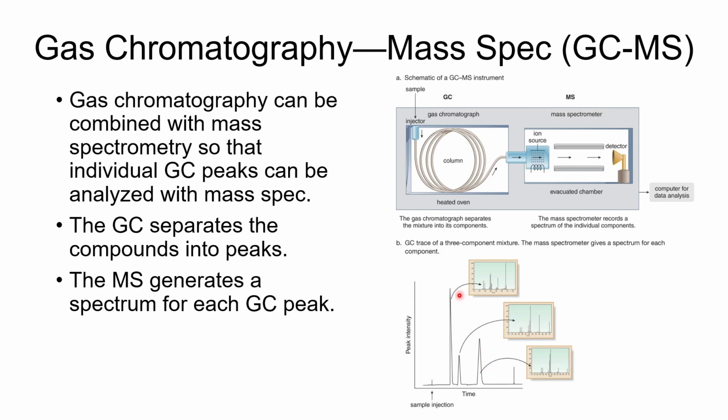You can even take this and do high-res mass spectrometry with it if you're very clever, although that costs a lot more to do. But this is just an example of what you can do. So if you've got a sample of compounds, you can kind of determine what they are and then combine that with some of our other spectroscopic techniques that we're going to talk about in future chapters. You can get a pretty good idea of what these compounds are, even if you have quantities that are so small, you may not be able to isolate them very easily.